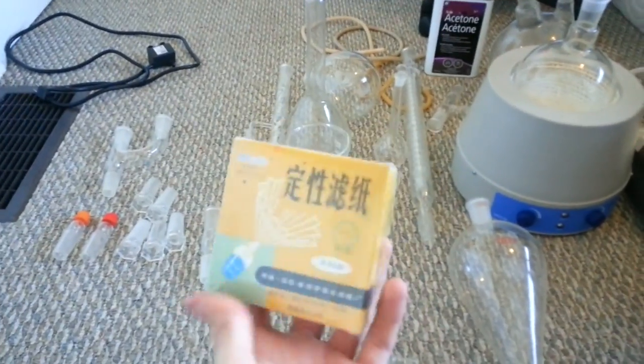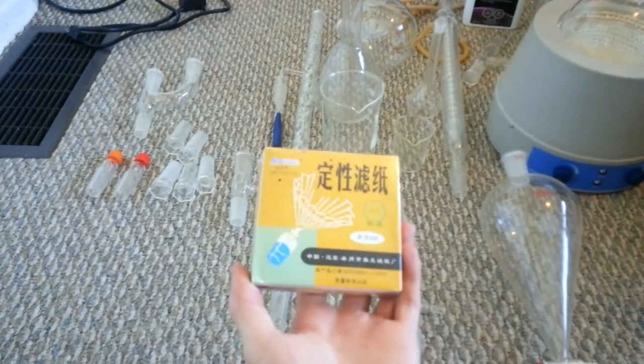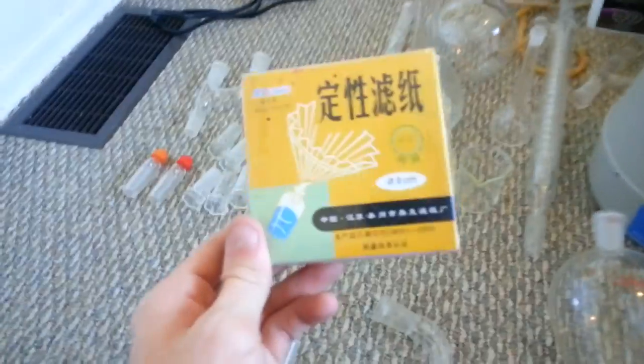Filter paper: I actually do not have a proper filtration setup, but I find that filter paper works pretty well for various things. You might want to get some regardless of if you think you're going to use it or not. Again, about as cheap as pH paper. Good stuff.